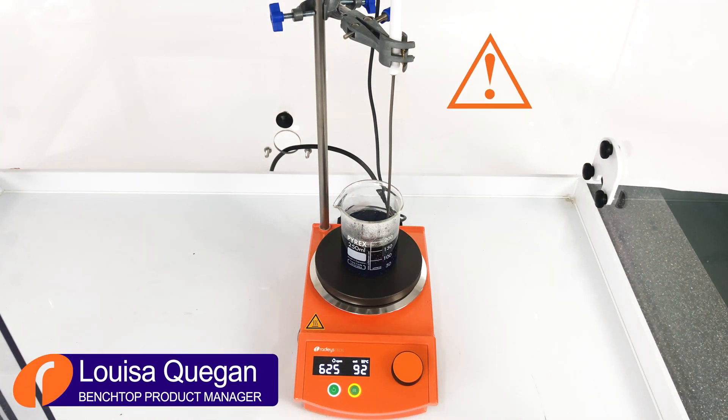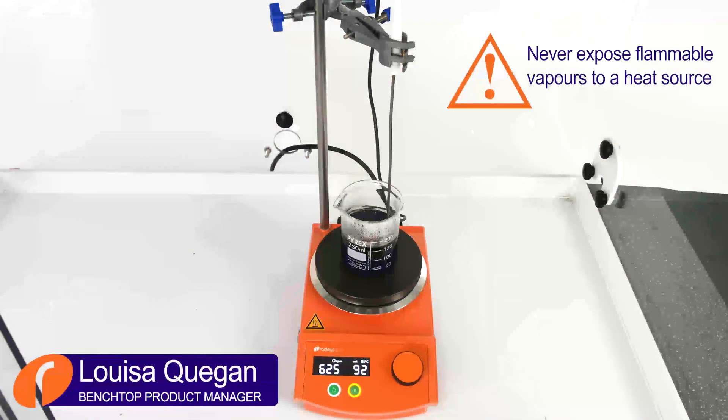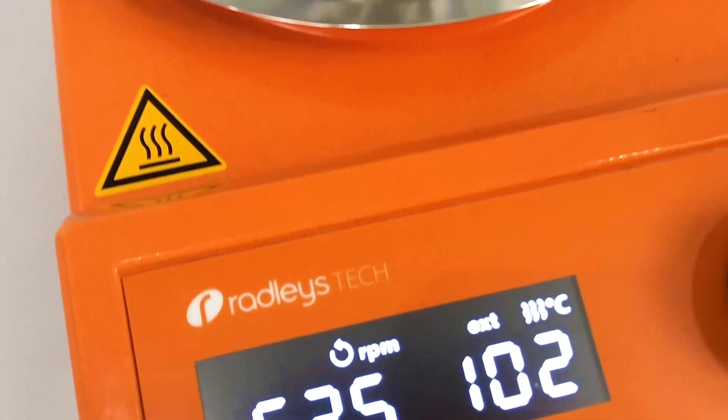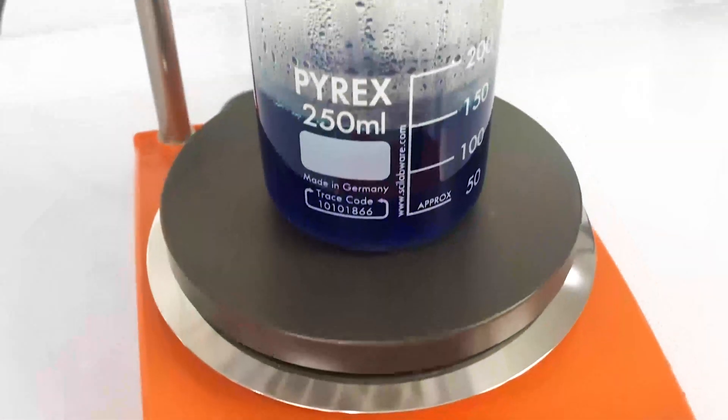Let's talk about how not to set up a reflux reaction and why. In this beaker, I've prepared approximately 150 ml of coloured water and started heating it by setting the hot plate to 15 degrees centigrade above the boiling point of water.